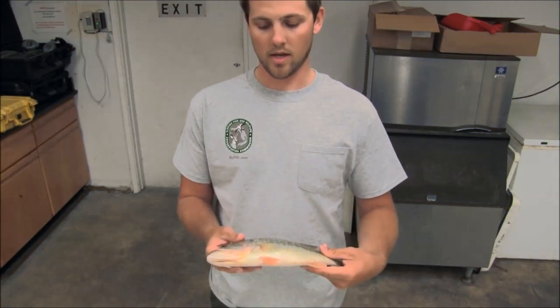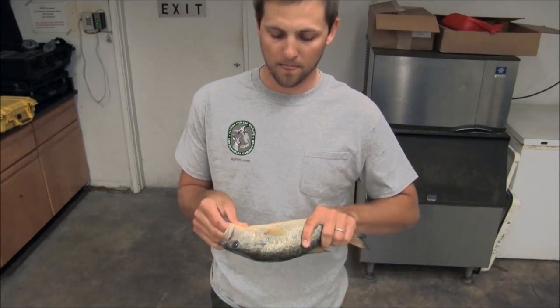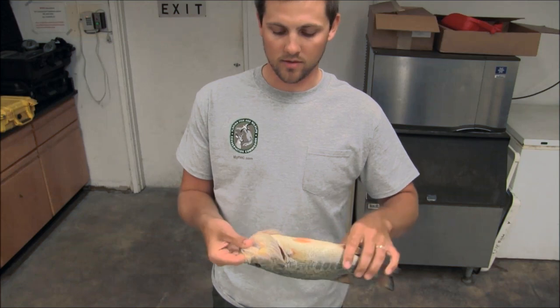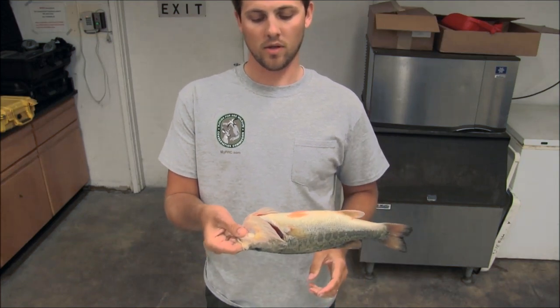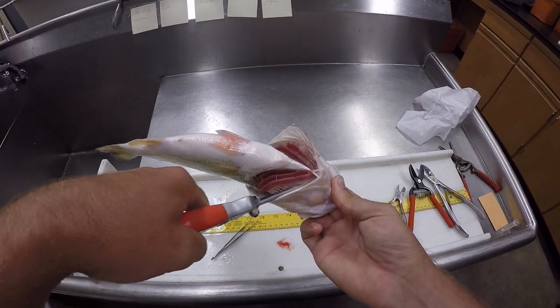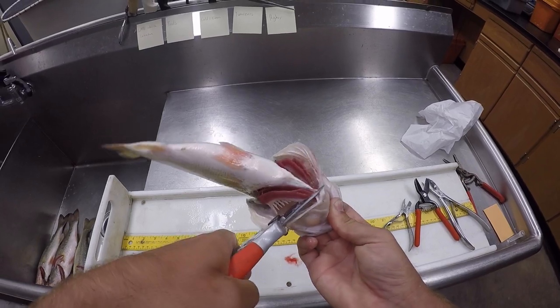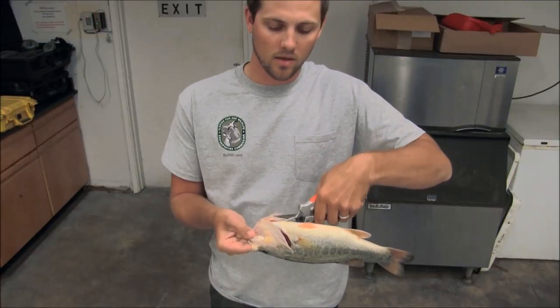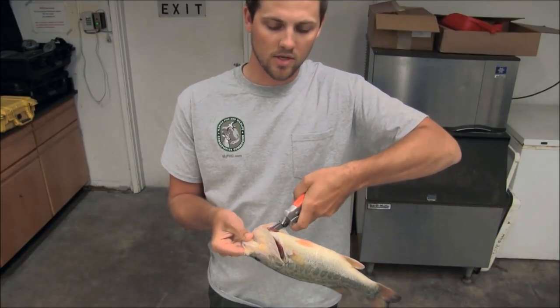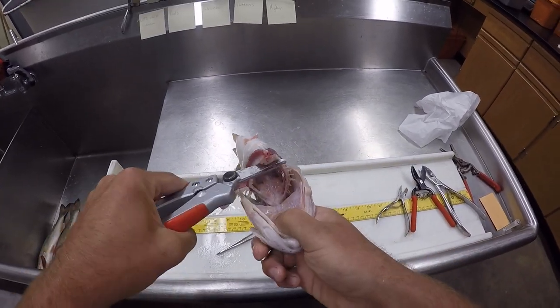So we'll get started. I like to start off by holding the fish on its back with a couple fingers in its mouth and just really open up those gills. You'll take your cutters and cut where all the gills come together — it's called the isthmus — and it only takes one or two snips and you've cleared out quite a bit of space for you to work with.